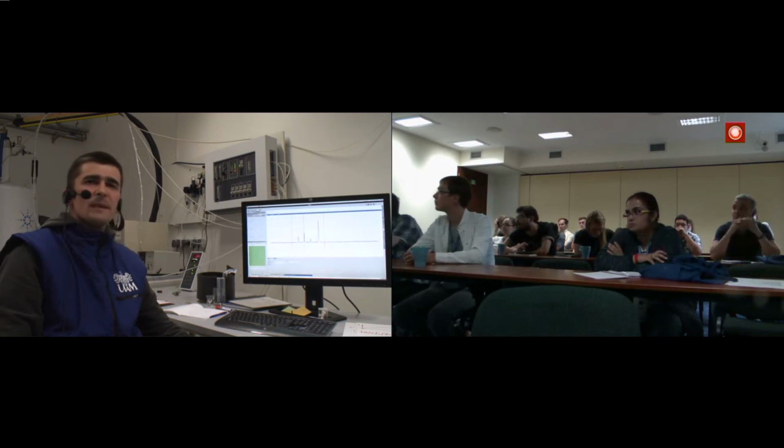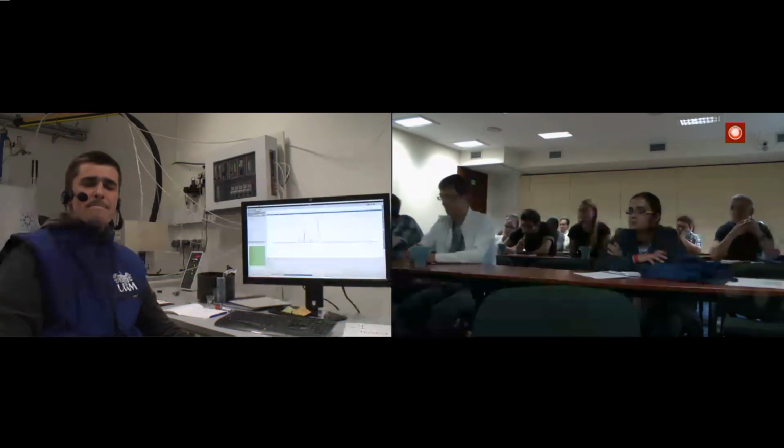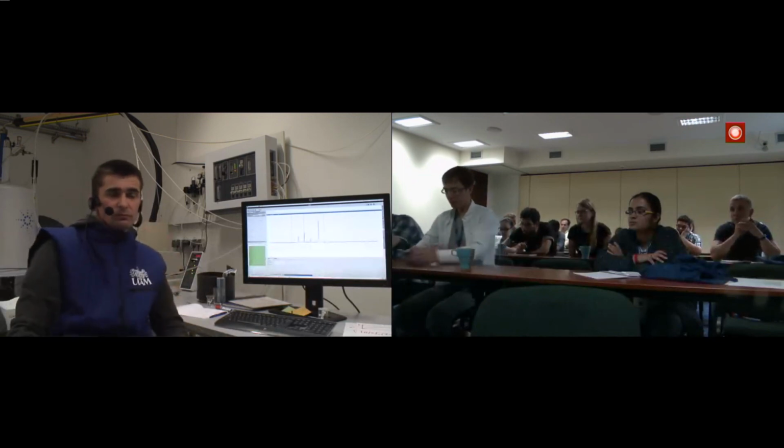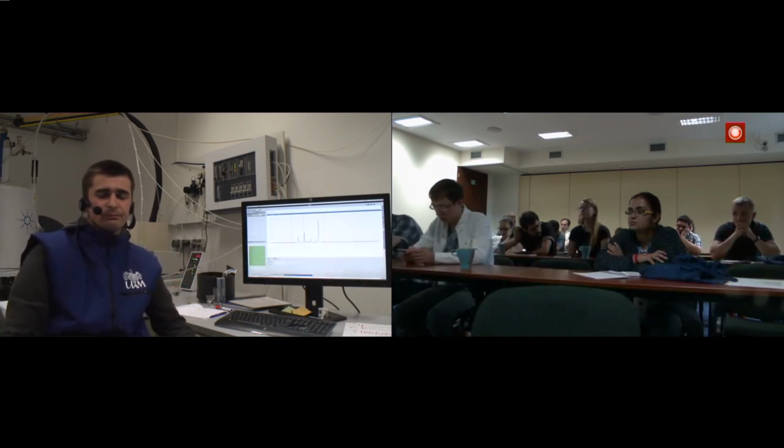May I add something to your question? In carbon-13 measurements, there is a small problem which is not easy to overcome, because different nuclei at different positions possess different relaxation times. So, for example, if you irradiate well, with well-defined pulses, for carbon-13 in the methyl group, the same is not true for the ring, and the population is not established in the same way.